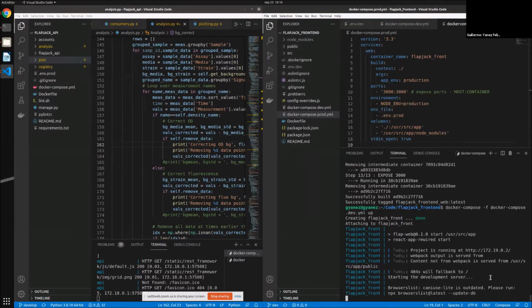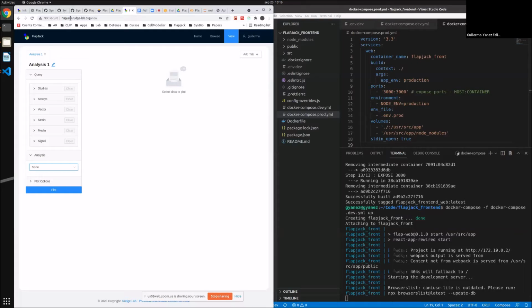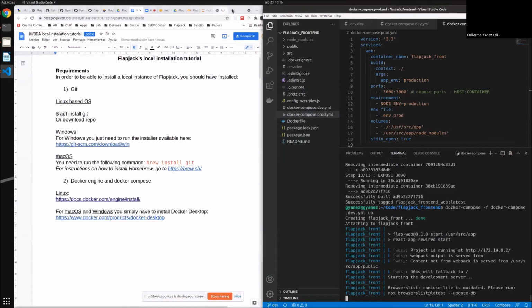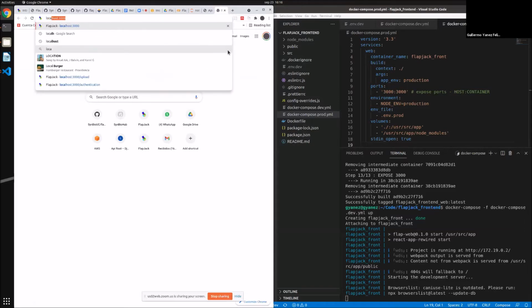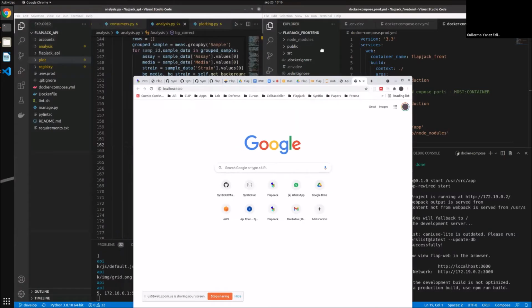Starting with my server. So this is the public instance, don't get confused. And now we need to check if our app is running, and it's not, because it hasn't finished this yet. Yeah.